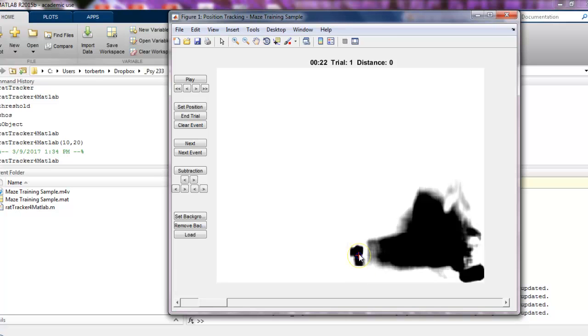So basically the program says we'll take the rat's current position, or where the rat was in the previous frame, if there is one, and then use this yellow circle to look for any places where there is a difference that crosses the threshold we've set. So any difference greater than 10 in this particular subtraction. Then at that point, average all of the X and Y positions and simply take that average to be the rat's current position. It's not a particularly sophisticated tracking algorithm, but it will work for our purposes.